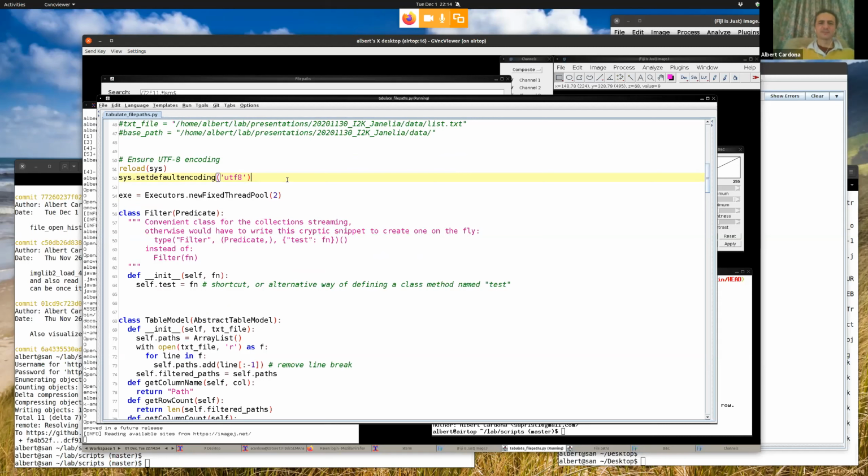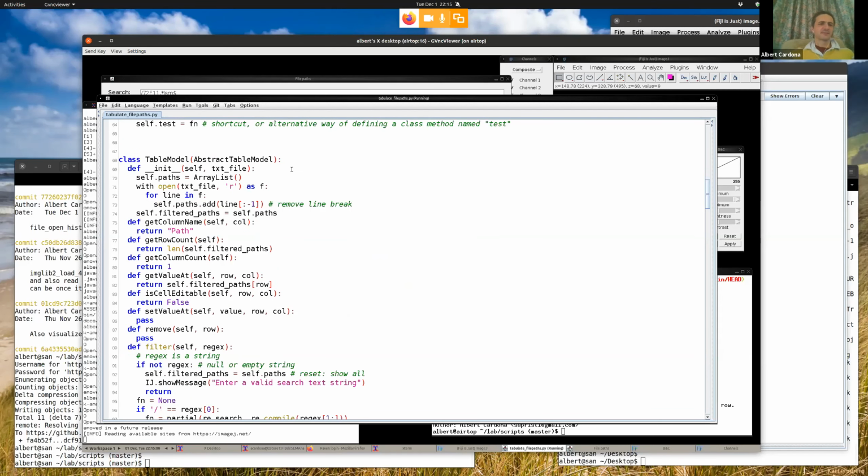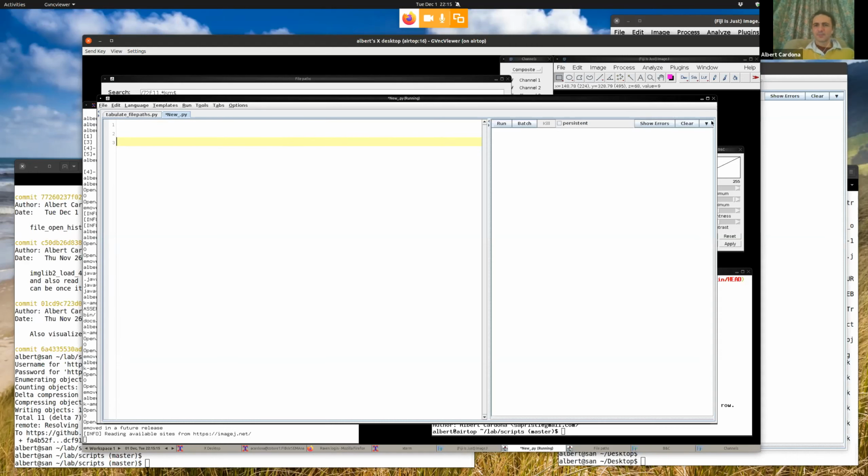So then, what else do we have? I'm going to ignore this for now, and I'm going to focus on this. What is this? We have a table in there. And so let's build this table from scratch. So what do we need first? I'm going to use the script as guidance, but basically, we should try to recreate it from scratch to see how you would do this.